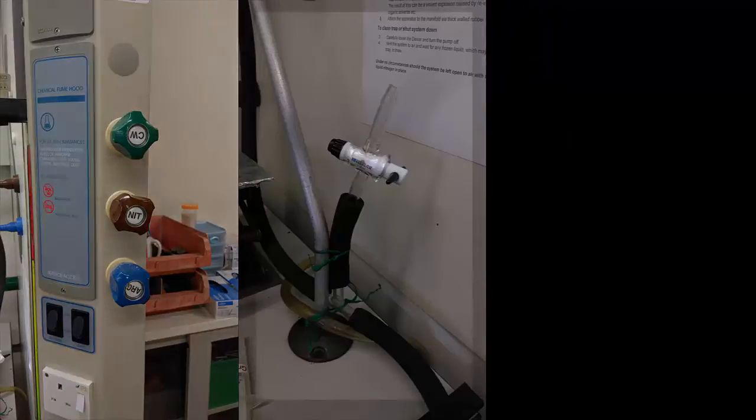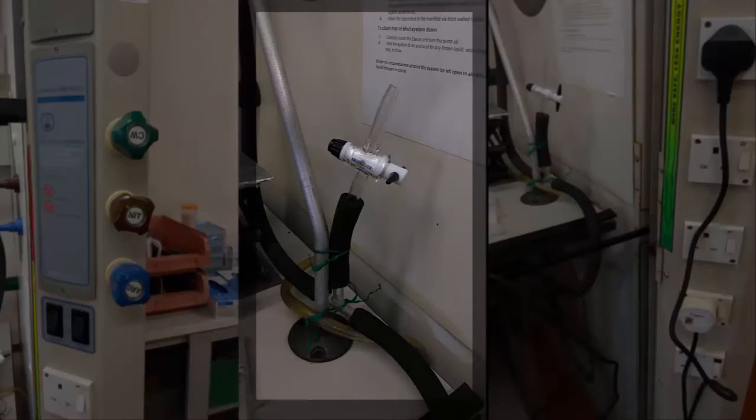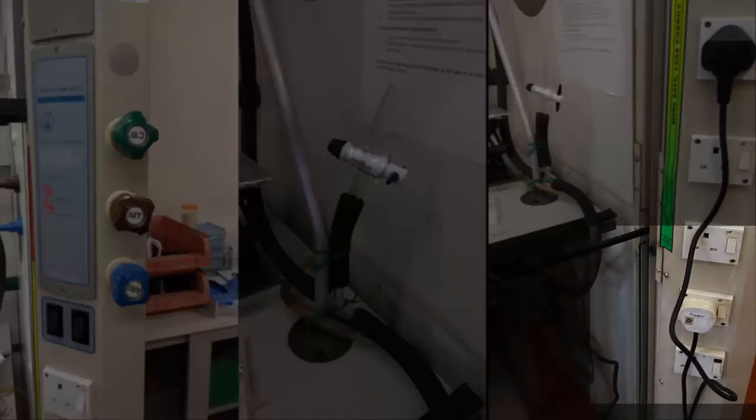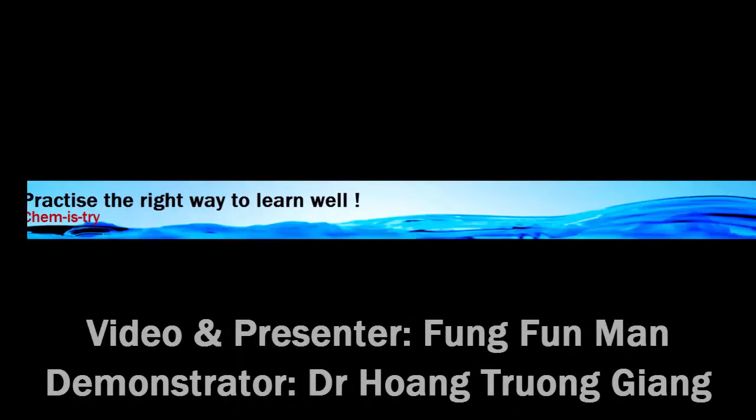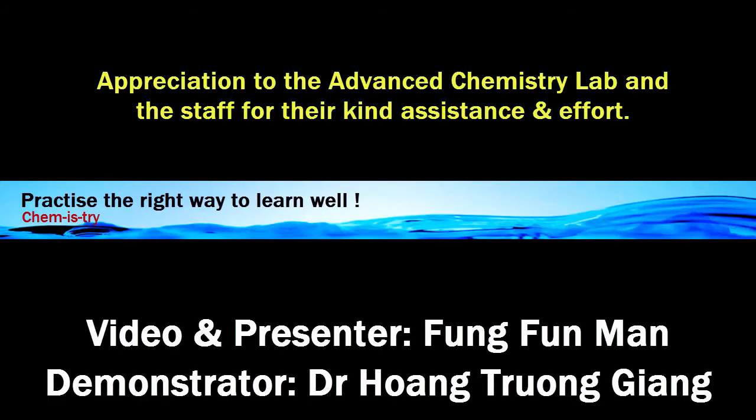And lastly, we turn off the nitrogen source, switch the outlet off the pump, and then turn off the main switch. Remember you always open the outlet of the pump first before you switch off the pump. Thank you very much. I hope you learned something from the video. Good day.